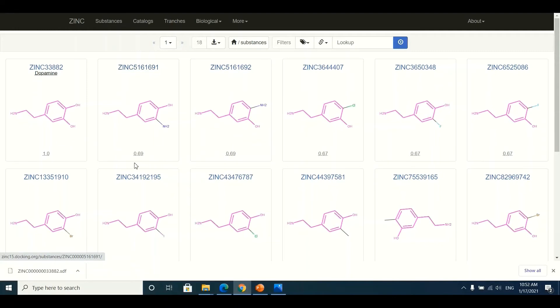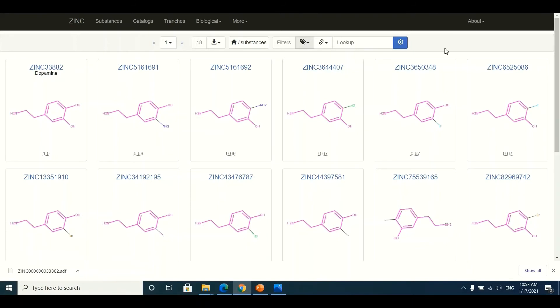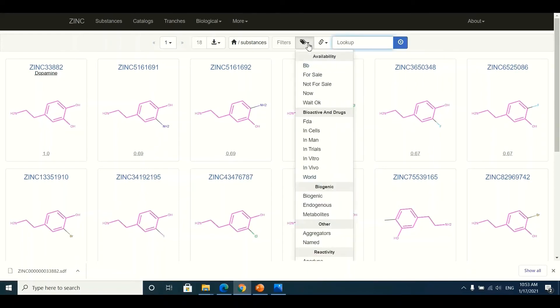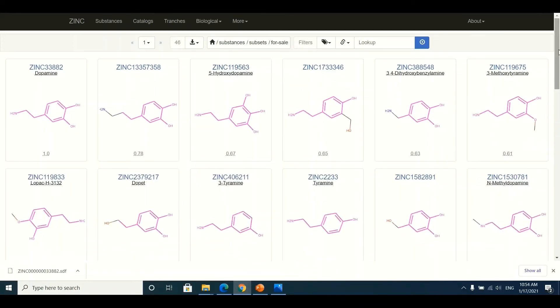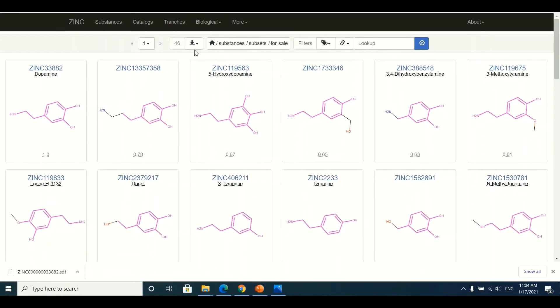The first compound, an exact match, will have a similarity score of 100% or 1.0. The second compound will have a score of 0.69, then 0.67, and so on. If I want to know how many of these compounds are commercially available for purchase, I click on the drop-down button and select 'For Sale.' The sorting will then filter results to show only commercially available, purchasable compounds.